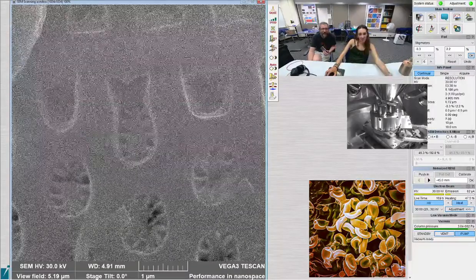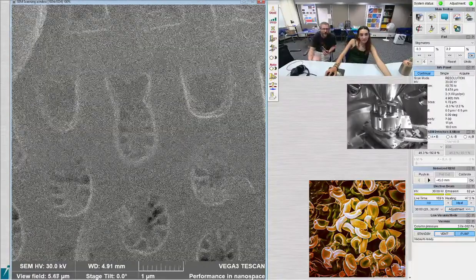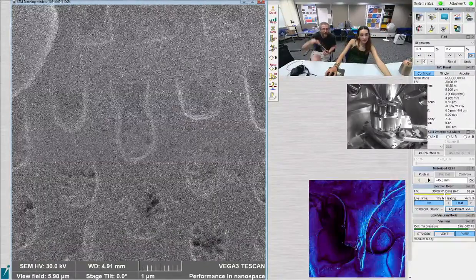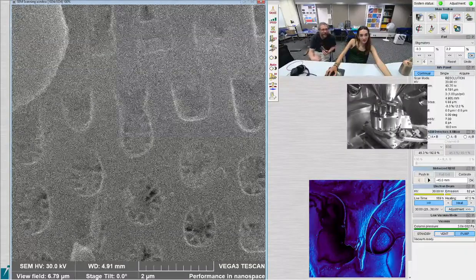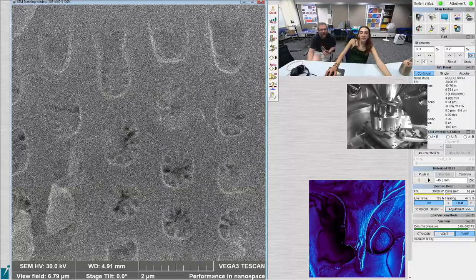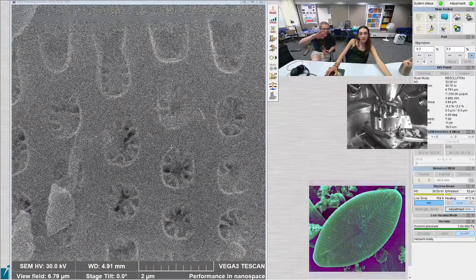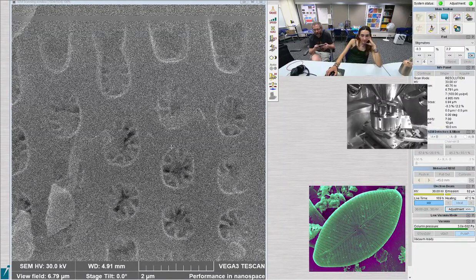I think you need to also auto brightness contrast, but slow the speed down to 7 and then hit it. Get the picture composed and then do it. I think it'll stand out okay. Okay, there. Then hit auto brightness contrast. I think part of the problem is it's just a little bit monotone-y, low contrast. Let's see.